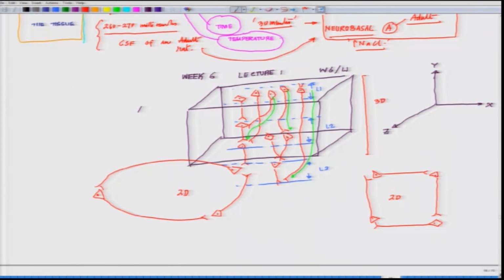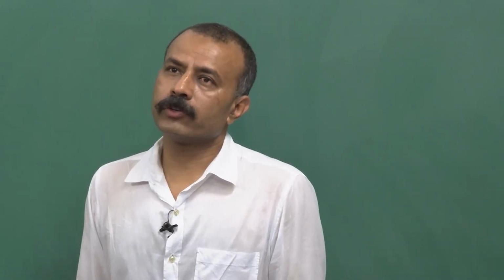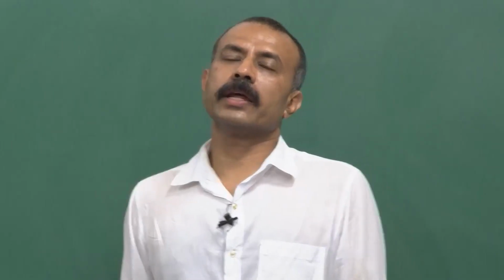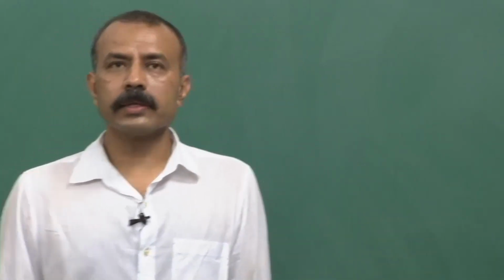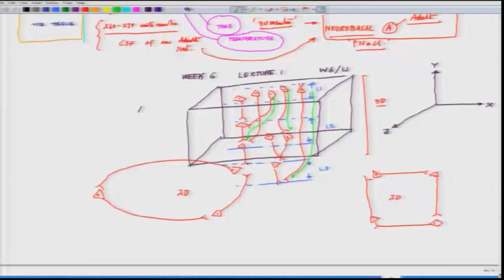And why these 3D patterns are so very important is that how one layer is cross-talking with another layer is still a tricky problem for us to tackle in an in vitro setup, and these things do matter. Why does it matter? You may have a series of neurons sitting here with a particular neurotransmitter type.